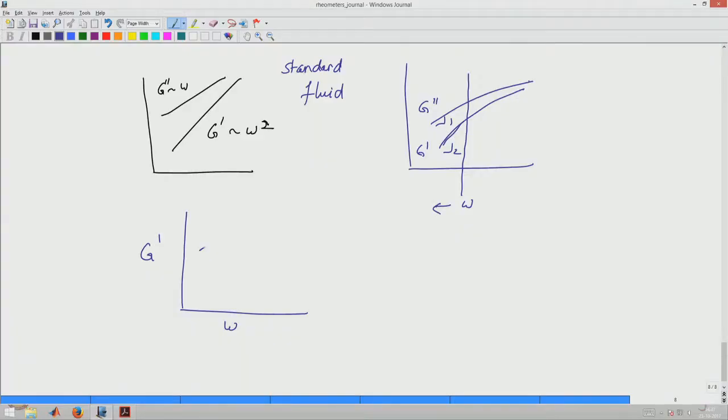For example, with some samples, when you do low viscosity measurements, it so happens that if you measure G prime as a function of frequency, you will get a G prime which seems more like a gel-like sample that we have seen, where G prime is relatively independent of frequency, and then suddenly there is a response like this, and we are talking about 2-3 orders of magnitude. So, let us say this is about 10 to the power 3 and this is 10.